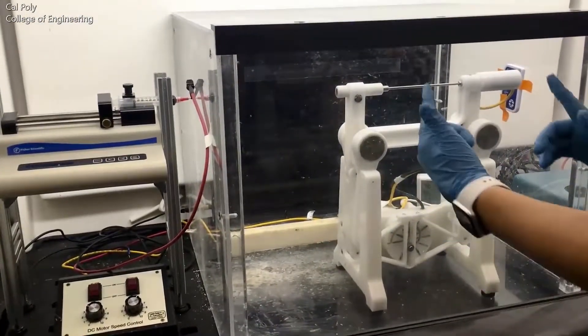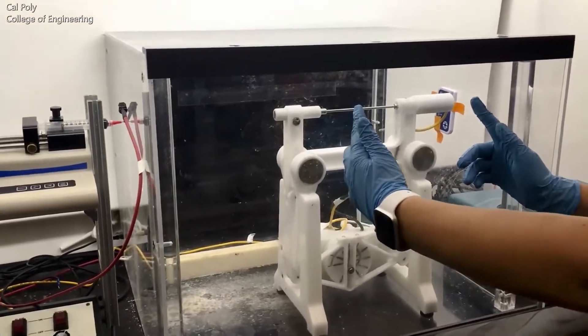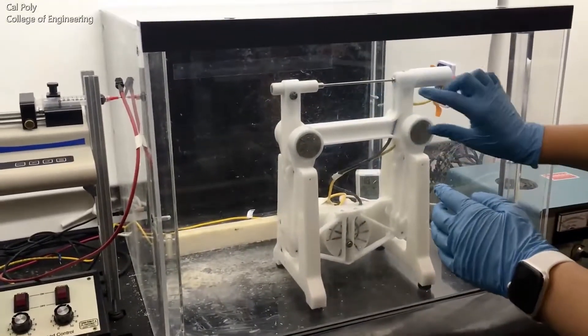The collector has a grounded metal mandrel which attracts the negatively charged solution toward it. The collector also translates back and forth as well as spins, allowing the polymer to collect evenly across the entire mandrel.